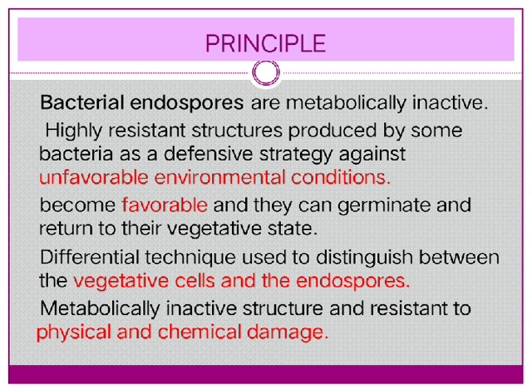The organism on the glass slide is fixed by heat and air drying. Apply malachite green, the primary stain. Now keep the slide over the heating water bath for 5 minutes. Remove the slide from the water bath and gently wash it under running water. Then, for 1 minute, coat the counterstain, 0.5% safranin. Examine for endospores on the slide by looking at it under a microscope.